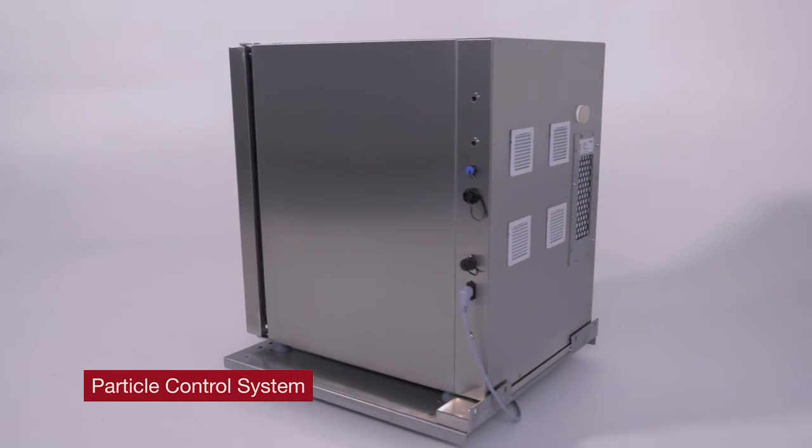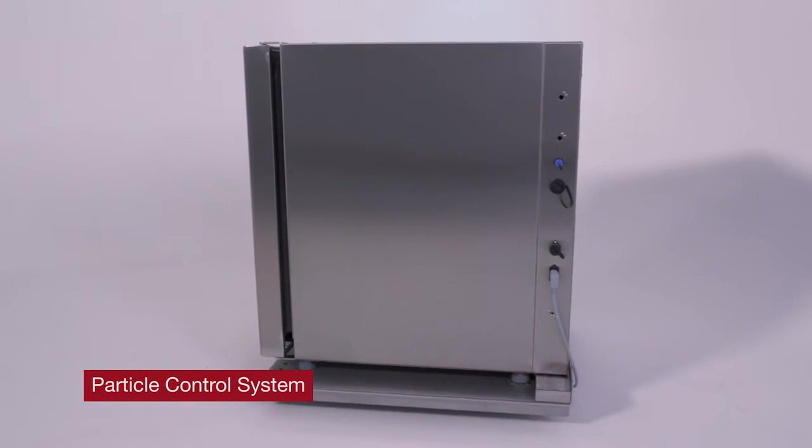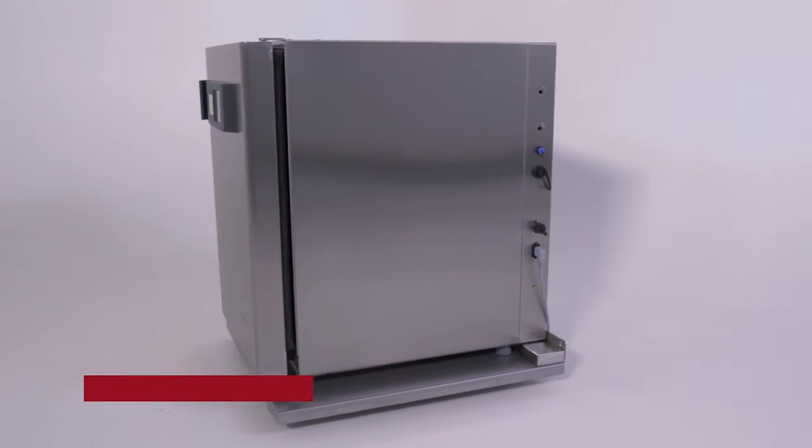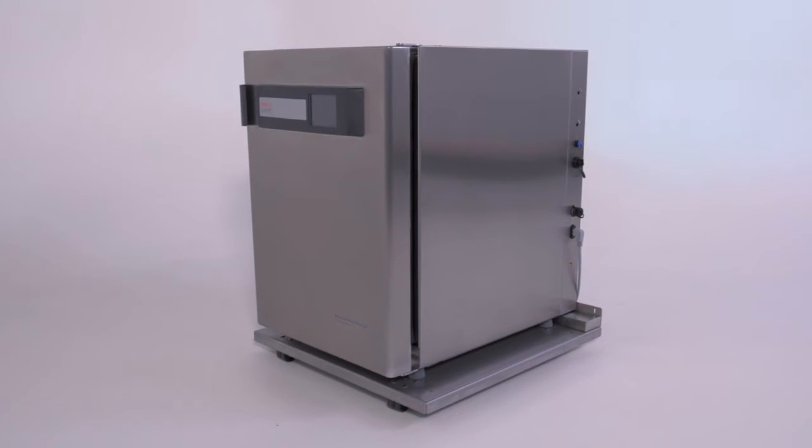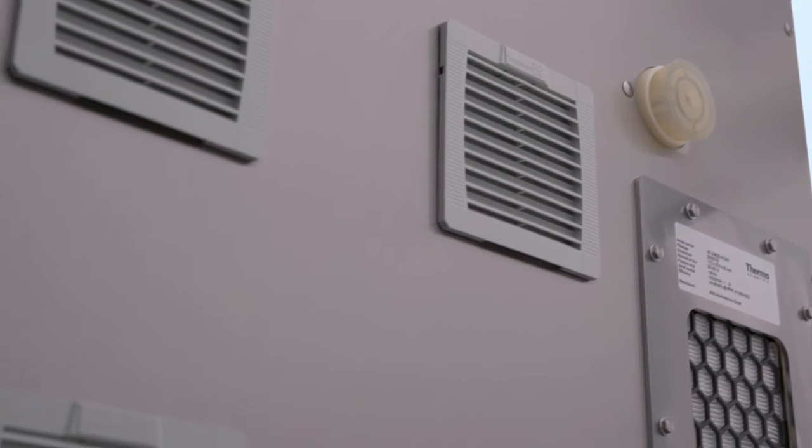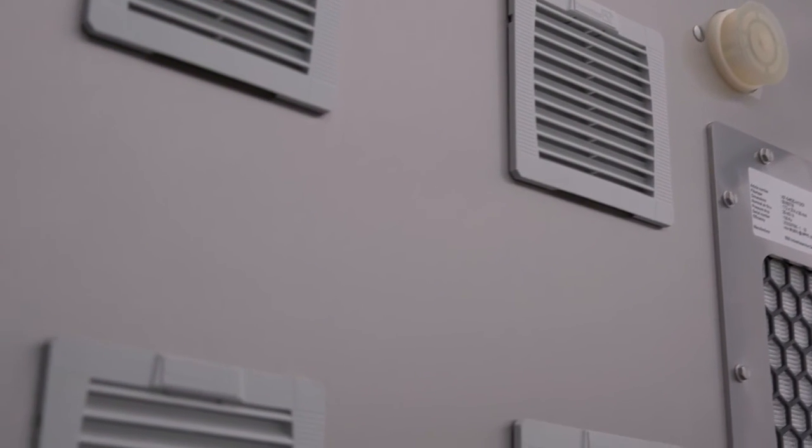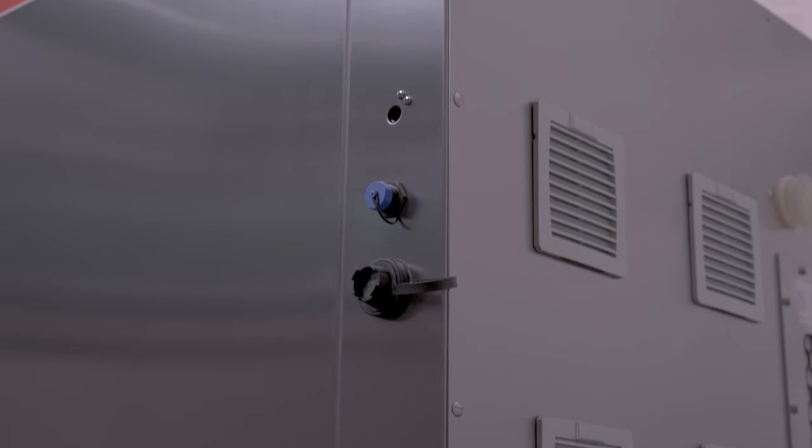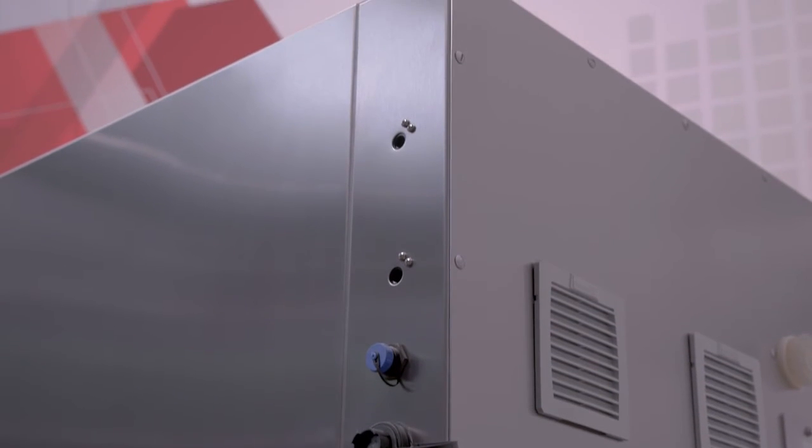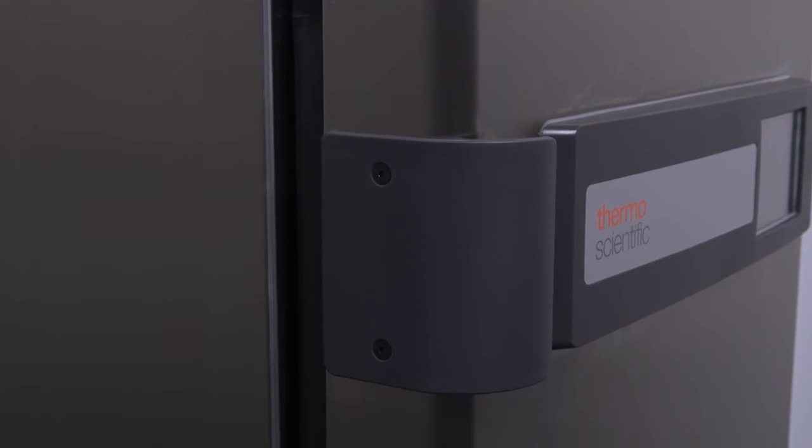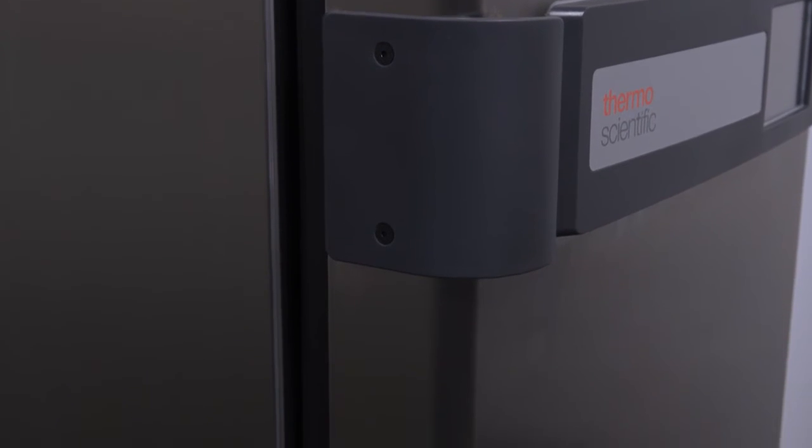The most important part of the Vios CR is, without a doubt, the particle control system. So this is the system by which we are controlling the particulates in a way that doesn't allow them to get released into the cleanroom. And this is really in the entire exterior of the unit.